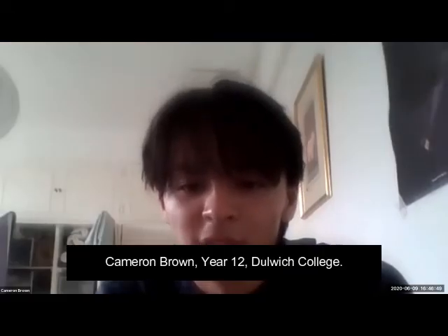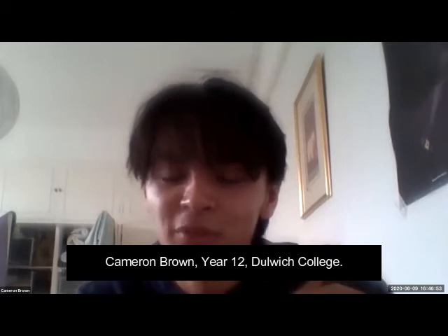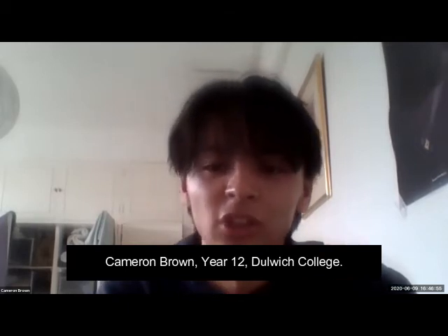The first question is by David Hu, and he's asking, hi, is the sample for infrared spectroscopy in solution or in pure liquid? If in solution, wouldn't it measure also OH bonds in water?